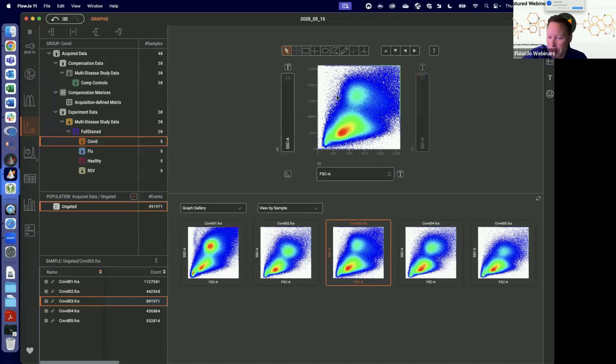Okay. Yes, if you're authenticating via a dongle, you would have to purchase a separate license. You can also trade in a dongle to get a certain amount of time on the subscription, which is used to authenticate both version 10 and 11. Which brings me to an important question. People will be using 11, people will be using 10. A FlowJo subscription license just gets you whatever version of FlowJo you want, so you actually will have the ability to use either 10 or 11.